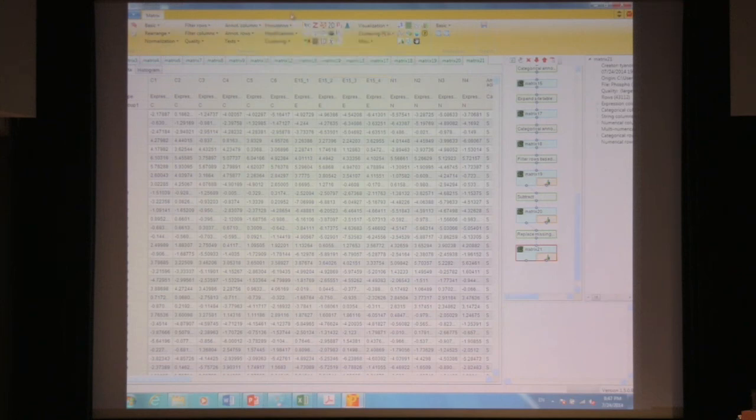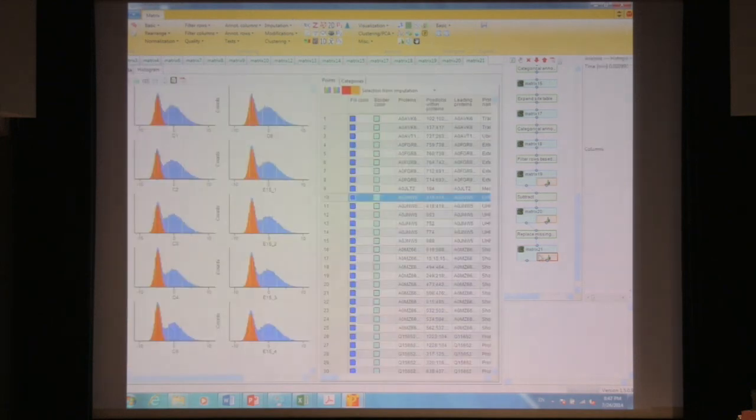Sorry, I had a simple question. When you're choosing your downshift, what exactly are you looking for to make sure that it's the right one? Because you said you just make it bigger and smaller. How do you know it's right?